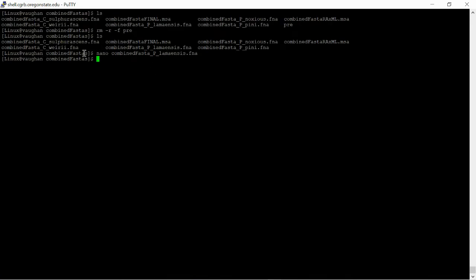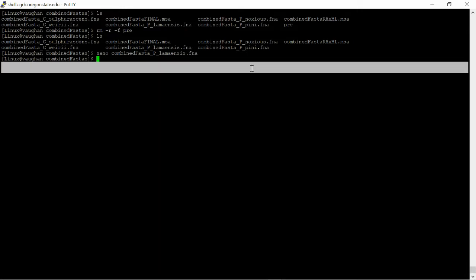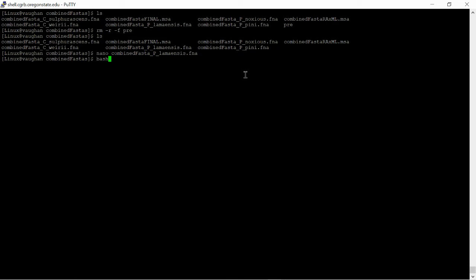So what we're going to do now is concatenate these five files together. And we'll do that again here with bash.